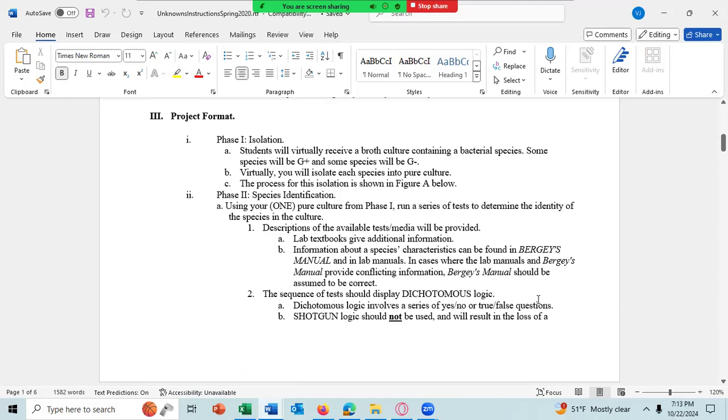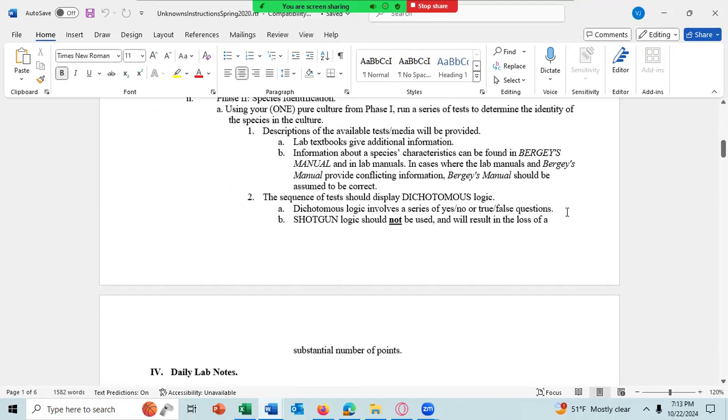Let's talk a little bit further. You will be graded on the logic that you use to perform the unknown project. You should be using dichotomous logic. Dichotomous logic means taking one test, having a yes/no answer. Let's scroll down to this page here.